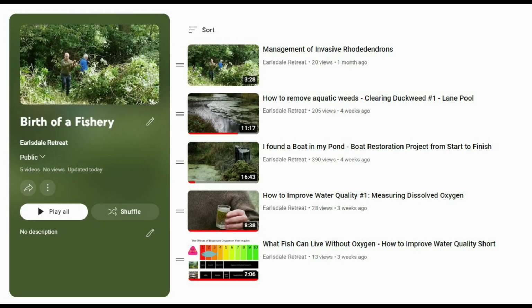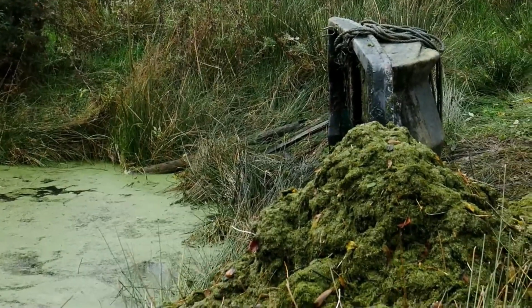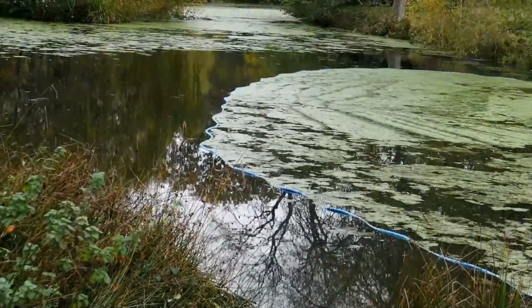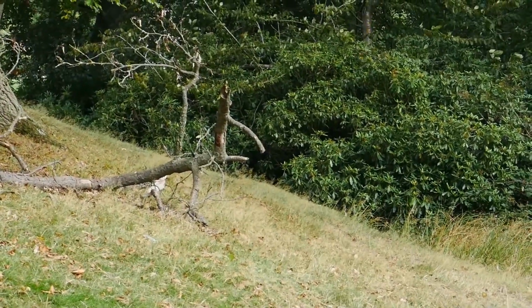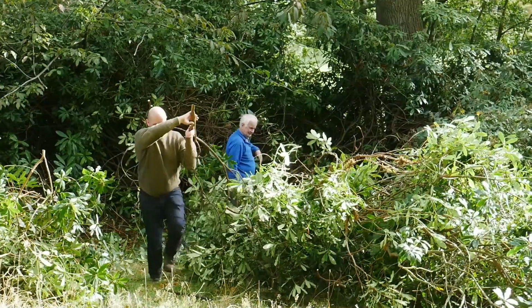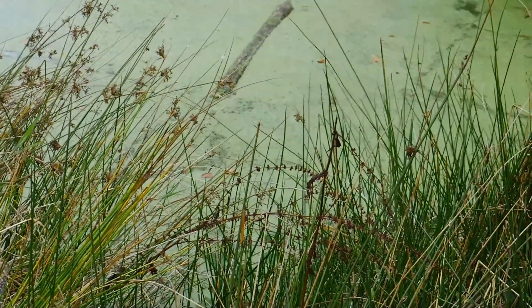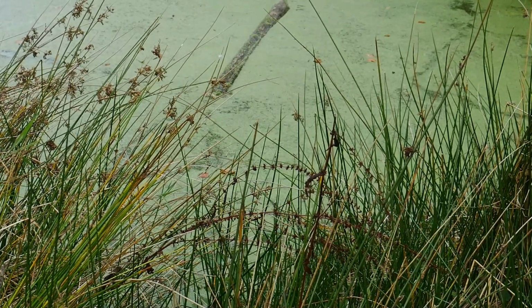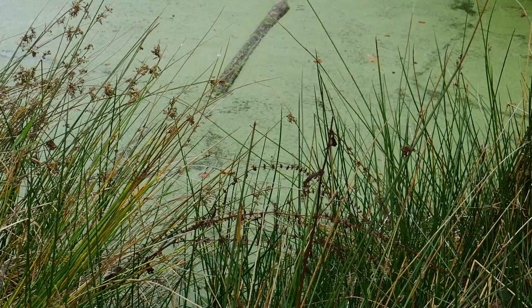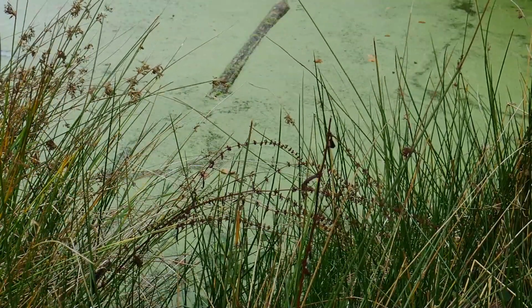All of the videos can be watched in the playlist Birth of a Fishery. I've repaired a boat that we rescued from the pond after it had sunk. We made a boom to remove excessive duckweed from the pools, and we opened up air pathways by removing invasive rhododendrons. To build up a picture of what's going on, I need to know what's causing low dissolved oxygen. This video focuses on measuring water parameters, and I'll try to explain why these parameters might be having an impact.